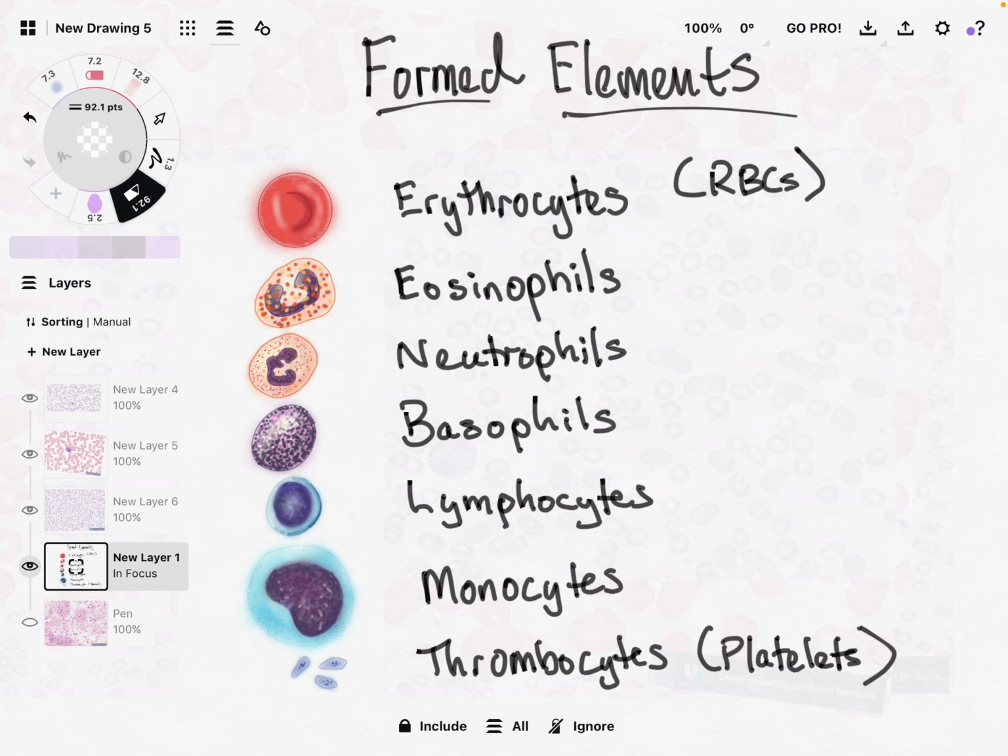If you want to get more specific, if you want to stain something like carbohydrates, you might use PAS, or if you want to stain really the DNA, you might use something like toluidine, some other type of staining process. But H&E does a pretty good general purpose of staining different types of cells within a tissue or even different tissue layers. Okay, so hematoxylin stains things that are acidic or basophilic.